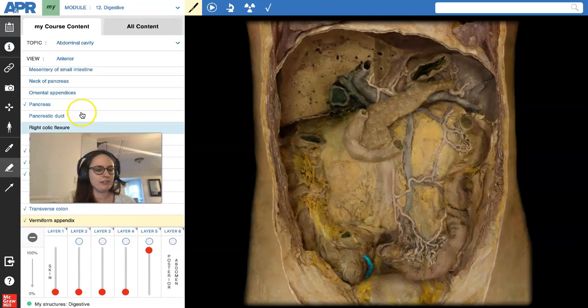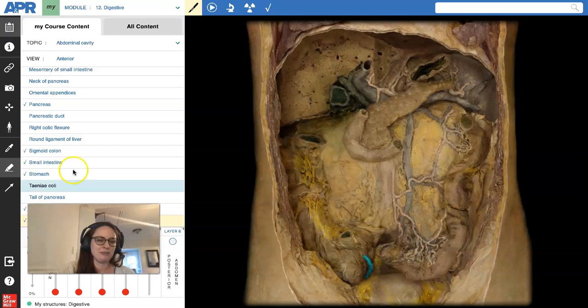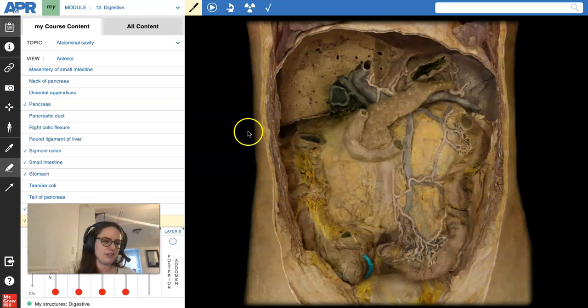Here's the spleen over here. And again, for some reason, they didn't put the spleen in this view, which is weird. So the spleen is right there. This is the respiratory diaphragm, which is another thing that they have not felt like highlighting on this particular page.